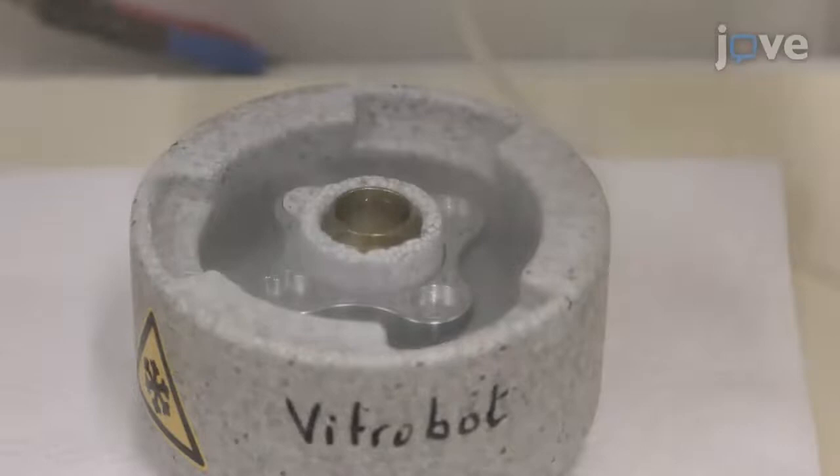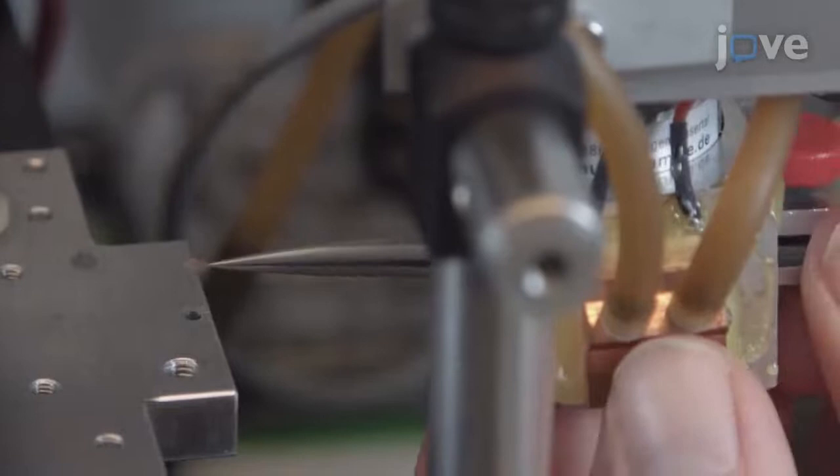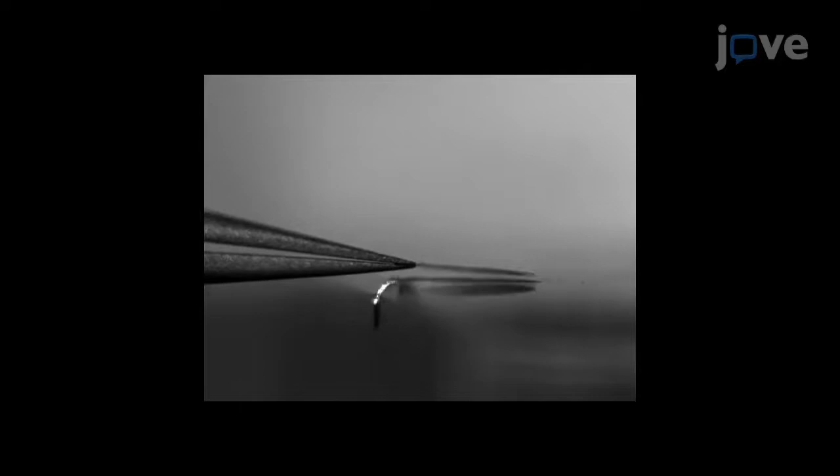Remove the spider. Place the polystyrol lid on top and place the cryogen container on the mounting in the cryo-riter. Grasp a glow-discharged EM grid with the cryo-riter tweezers. Mount the tweezers on the electromagnet and screw the micromanipulator to align the grid flat on the stage, carbon film side up.